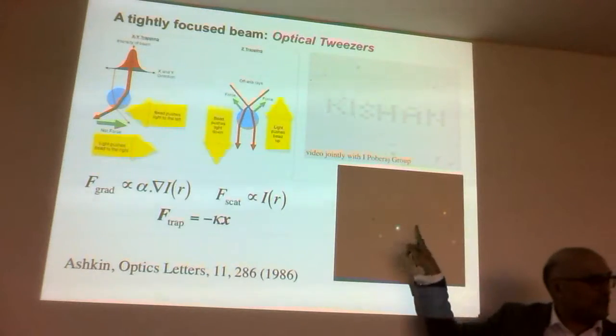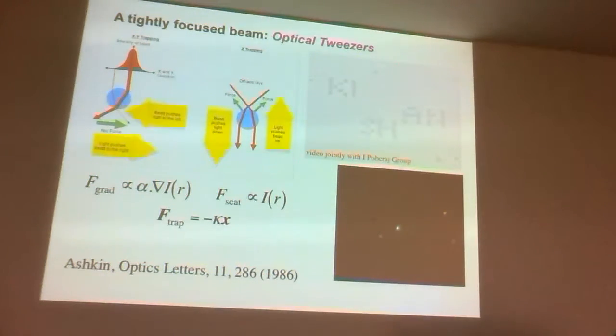That's because of the polydispersity in the plasmon resonance. Let me just end up with you again, because it's quite cool. So you can see that, and in the middle it looks white. Why is that? Because a lot of particles collect. I'm not trying to be clever and just trap one at the moment, but as they all collect, they average out to give me beautiful white. Okay? You see sometimes a red one comes in or a green one, etc.